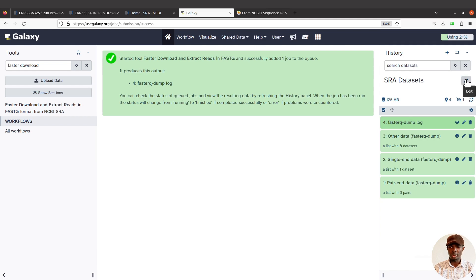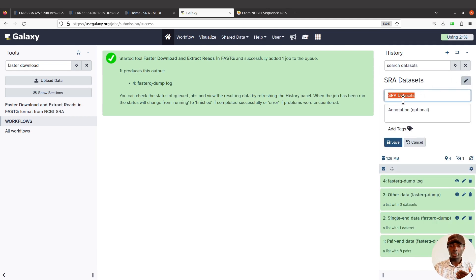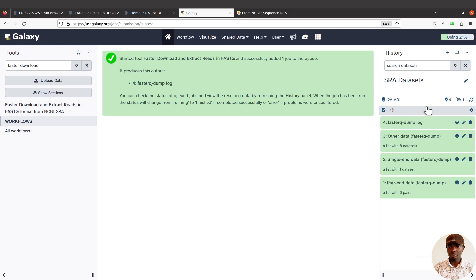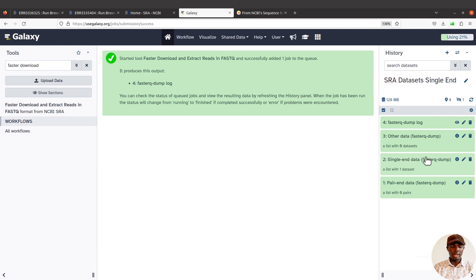I should have labeled the history as single-end. Let me rename it — I'll call it 'SRA datasets - single end'. I've renamed it. Now with the imported data you can proceed with your other analyses. This data is Oxford Nanopore long-read data, and I've also shown how to assemble Oxford Nanopore data with Flye on the Galaxy platform using this same data — check the description box for that video if you're interested.